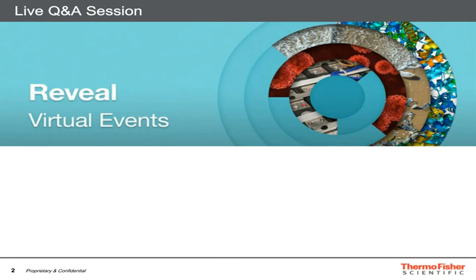Right. Yes. Thanks. And the last question, is it possible to use SERS with XPS? Sure thing. So SERS in this case is surface enhanced Raman spectroscopy. At a high level, the answer would be yes, you can take your sample and dope it with either SERS active nanoparticles or some sort of SERS active surface.